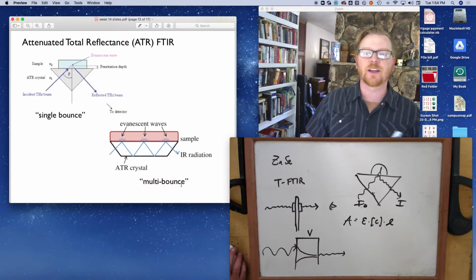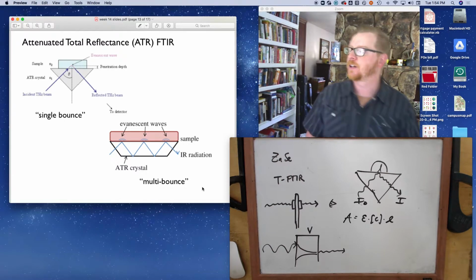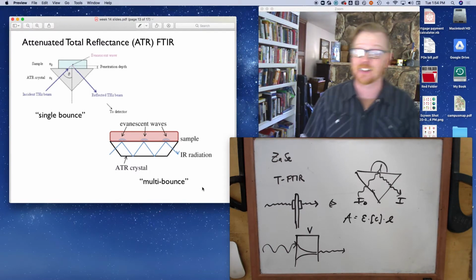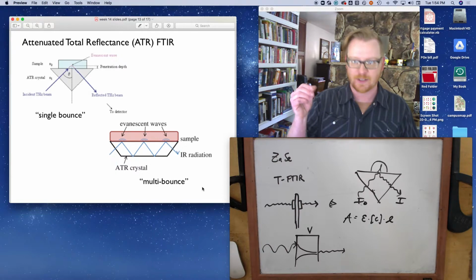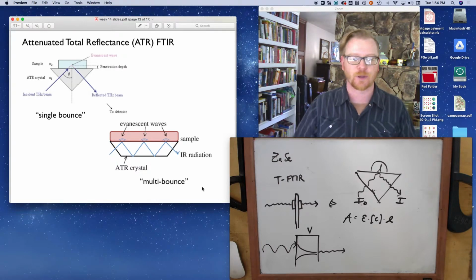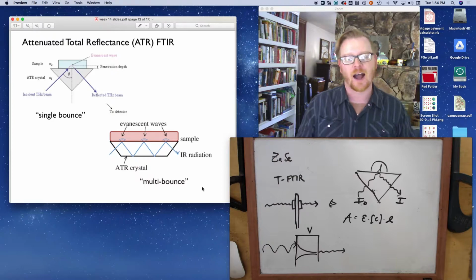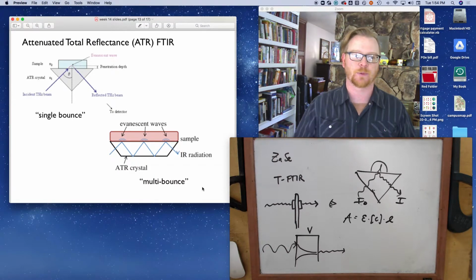I have a really cool germanium ATR accessory, and I didn't bring it home. I wish I would have. You've probably never seen germanium before. It actually looks a lot like graphite. It just looks like this kind of silvery hunk of graphite, which is pretty cool. And it's a solid piece, so it doesn't look like it's an optic, but it's an IR optic, right? It doesn't have to be transparent to the visible, okay?